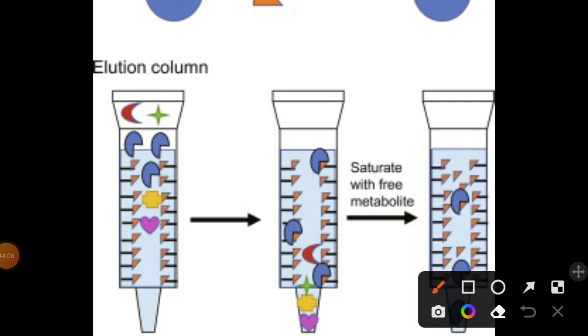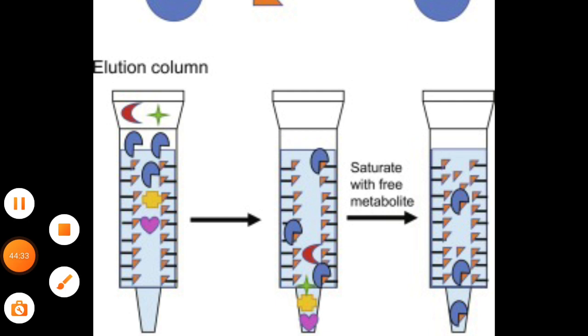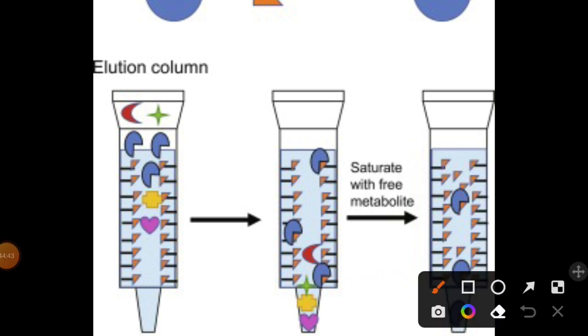I have already mentioned that the advantage here is high, extremely sensitive separation. And the biological active site that we want to use can be easily determined, so we don't need to bother too much. But it has some unfortunate disadvantages too. So what are the disadvantages?